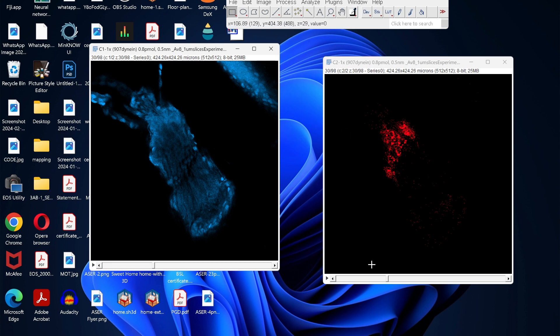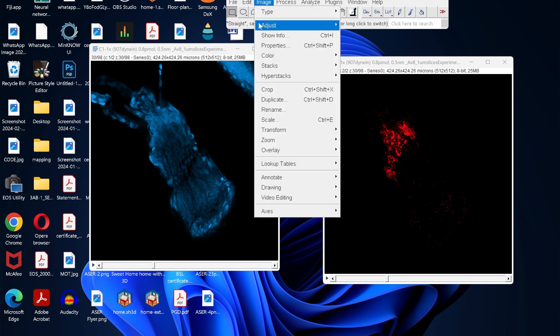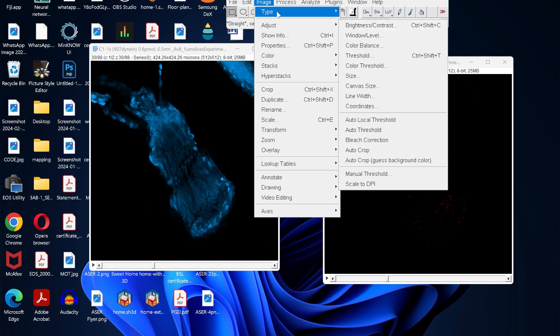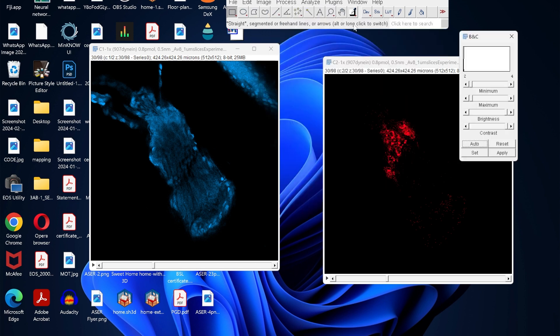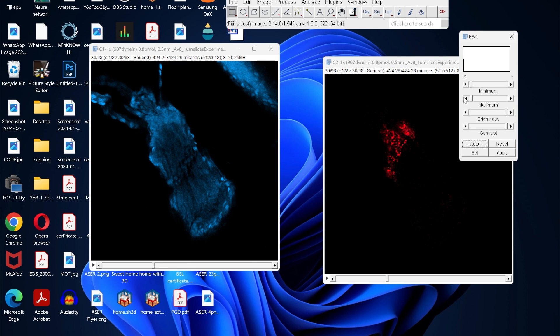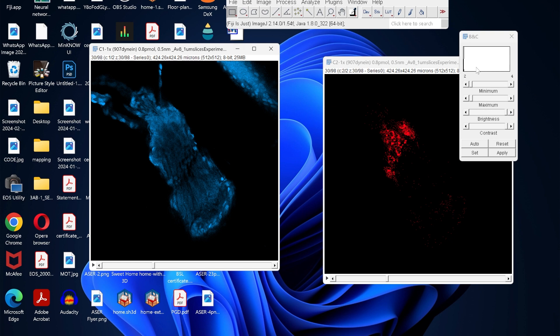Once you separate these channels, you still have the option to adjust the brightness. Go to the image, adjust brightness, and then you can change the brightness. Similarly for the other channel.